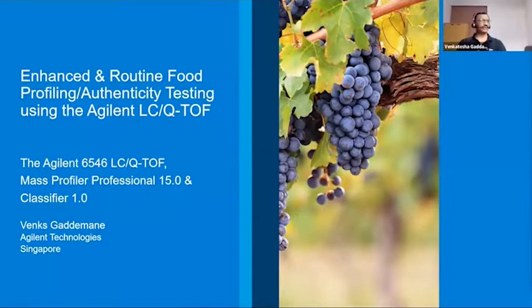Hello, everyone. Thank you for your time to attend today's webinar from Agilent. In this session, I'll be talking about enhanced routine food profiling or authenticity testing using Agilent LC Q-TOF. I mention again, it is routine food authenticity testing, which is very essential nowadays, as false labeling or adulteration in food are a growing problem for food manufacturing.